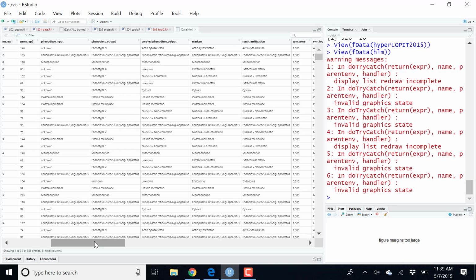So this data set looks like this, where we have the expression matrix. And then here we have the feature metadata. And one of these columns, that is called markers, contains the information about the subcellular localization. They are not next to each other, but here I'm going to draw them. So here is one class, let's say the black class, here's the white class, here's the stripy class, and here's the dotted class.